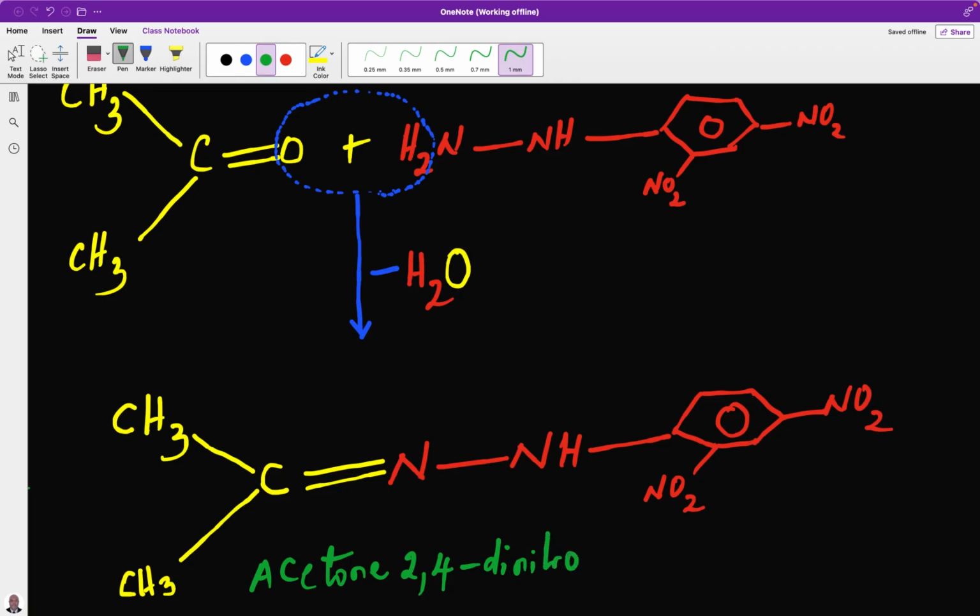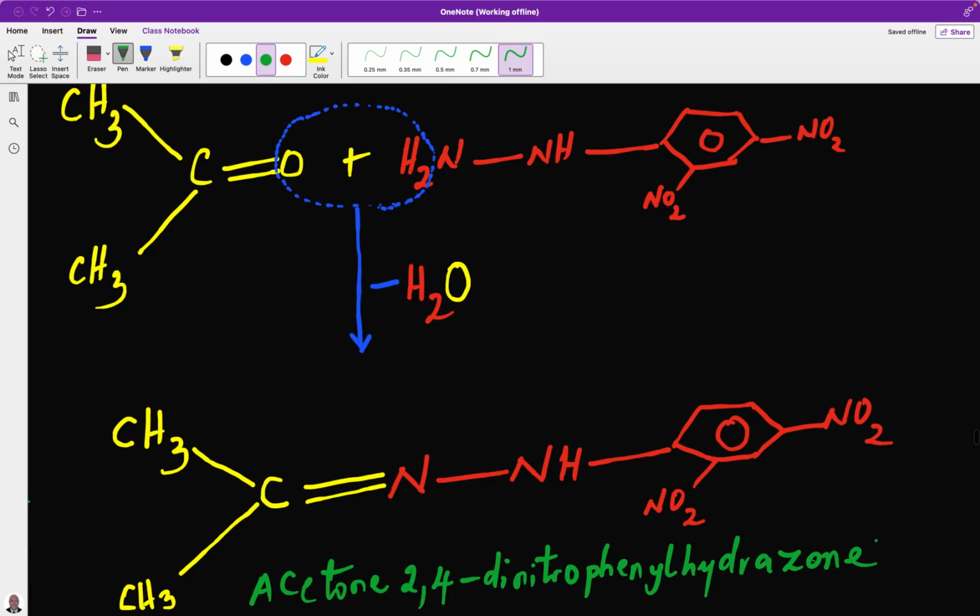Dinitrophenylhydrazone. So we will have this as our product.